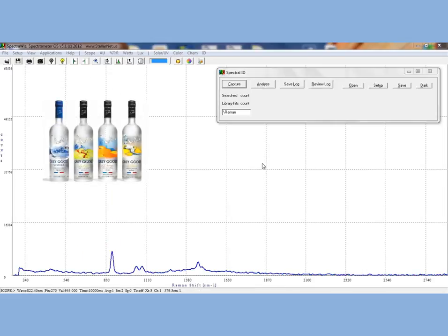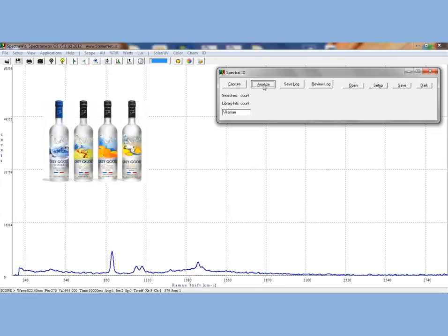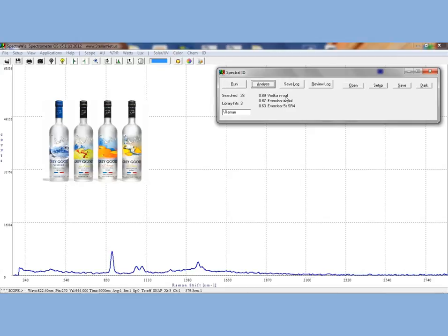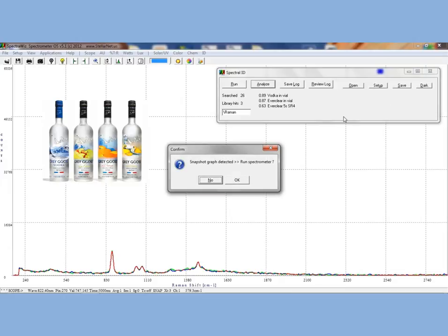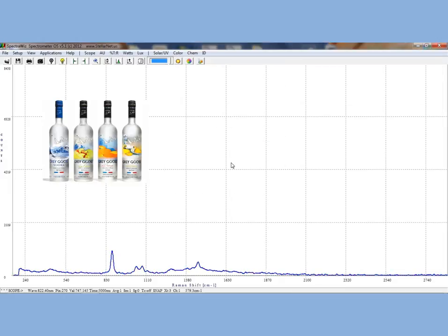In the last example, let's look at vodka, which is a distilled beverage primarily composed of water and ethanol with trace impurities and flavoring. You can see from the Raman library matches that we get vodka in a vial as their number one match, with also other hits from Everclear, which is a similar water-ethanol-based beverage except with higher concentration of ethanol.